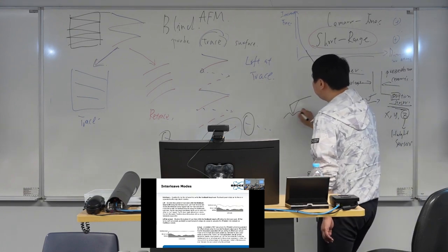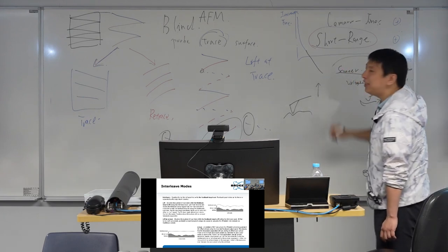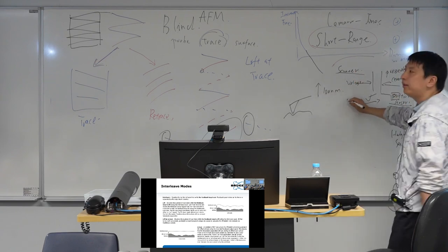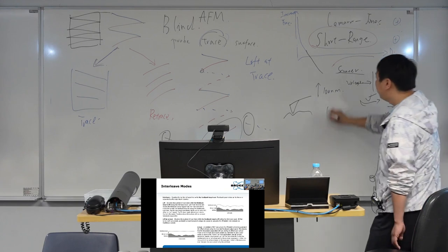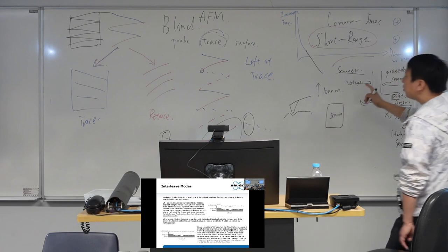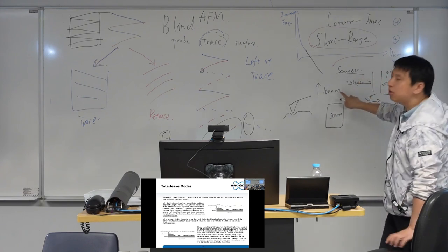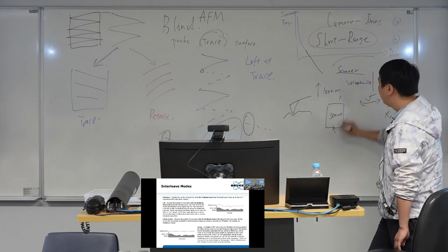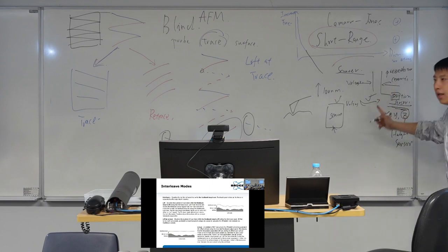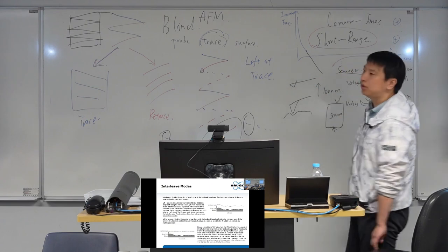The probe at the beginning is on the surface, and then we want to lift the probe, say by 100 nanometers. And how do we achieve that? We have the scanner. We calculate if we want the scanner to shrink 100 nanometers, how many volts we should apply. And then we apply this voltage on the scanner, the probe lifts up.